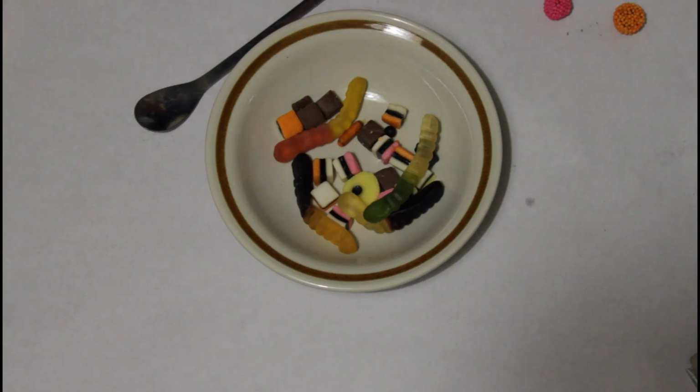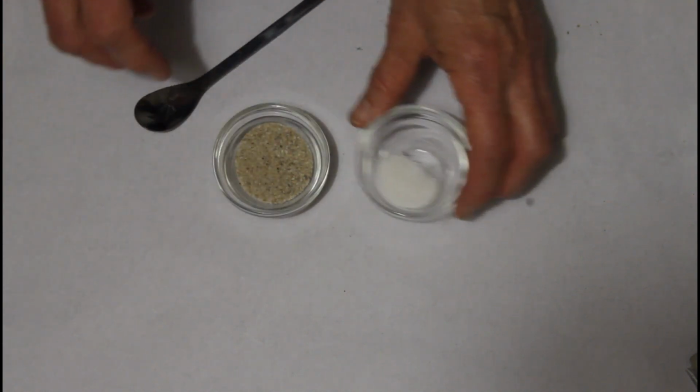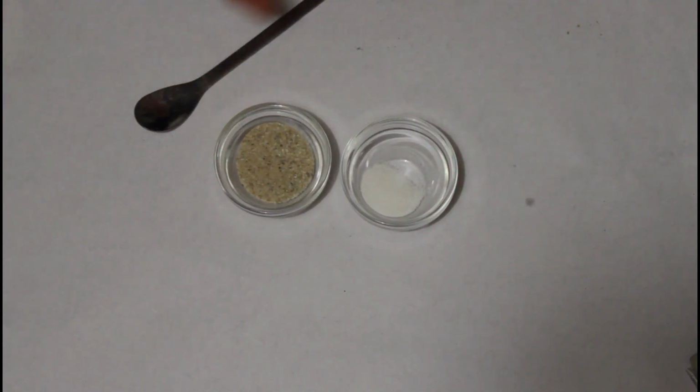It's got its same ordinary taste that it always would have. Just because they've been mixed in a group, it hasn't changed the flavor. Number 5 says we must investigate the properties of salt and sand. So I have some salt and I have some sand.